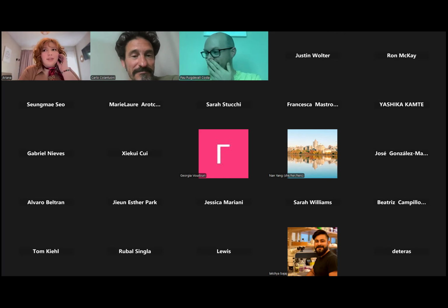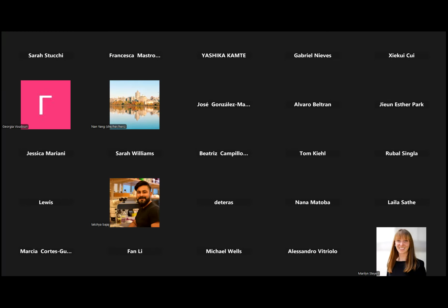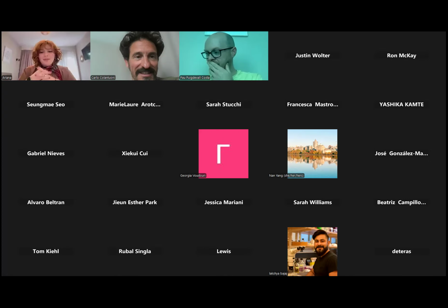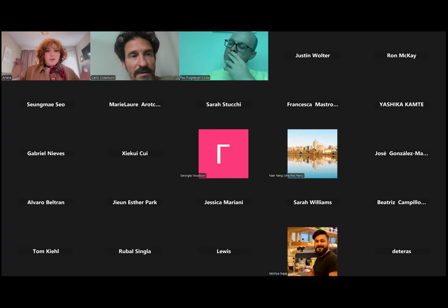These are individually, and it was a lot of work, and it wouldn't be possible without this amazing team and without Jason's guidance. But what we did first is that we differentiated these cell lines in different rounds, and every round had between 10 to 15 individuals.